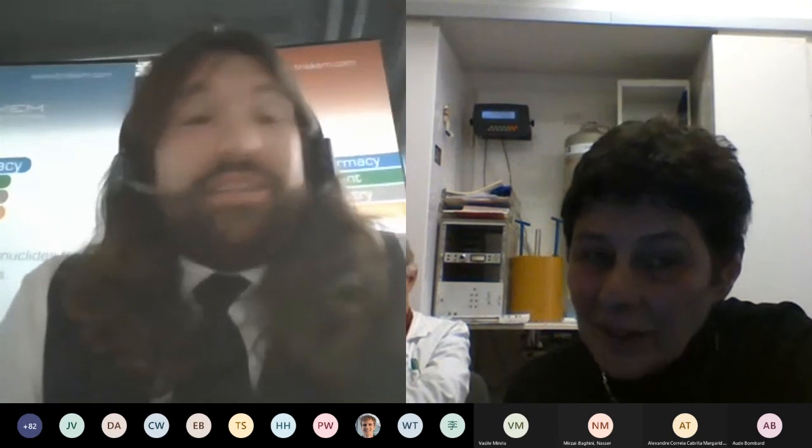Okay. And then there's a question from Eva Kabay, so you should know her. She was wondering if the actinides are reduced when you load them on DGA. So why do we do it in reduced form? If she understands well, you're loading in the reduced form.